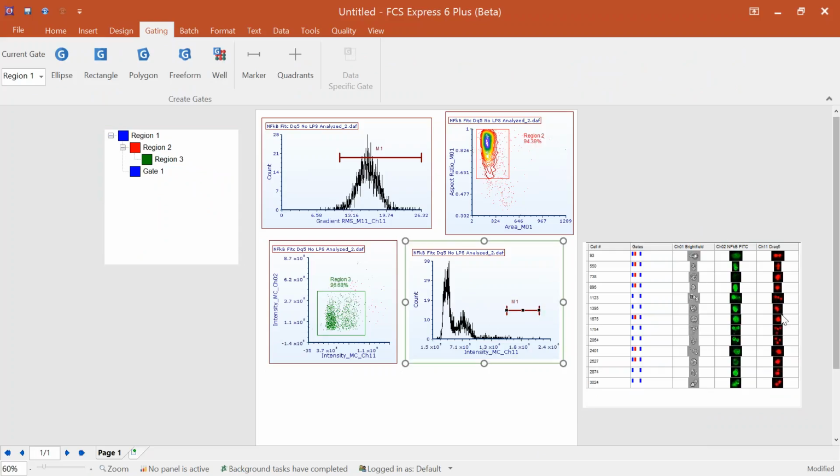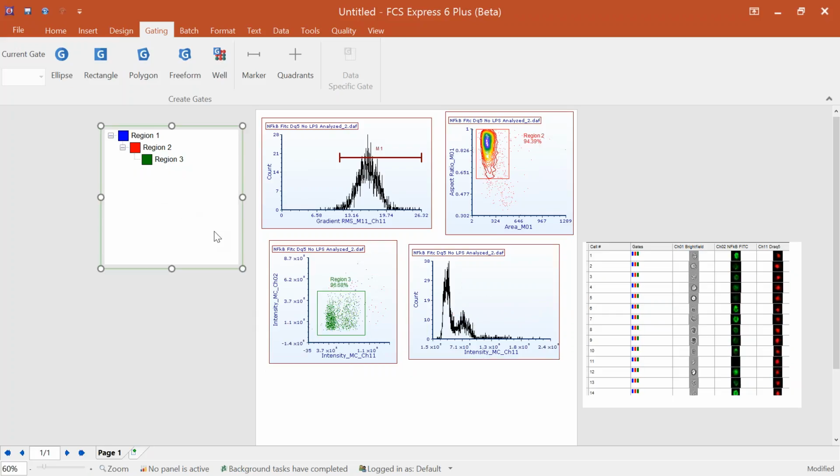So you can see some of these, they might be dividing, they might be outliers. We probably do want to exclude them. There's not too many. And if we get back here and take a look at what's going on with the rest of our analysis, we can see that these are probably events that we want to analyze. Again, you can always go back and find out what about the morphology is most interesting for you as well. So for now, we'll just remove that gate.